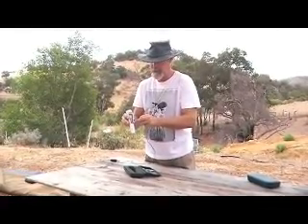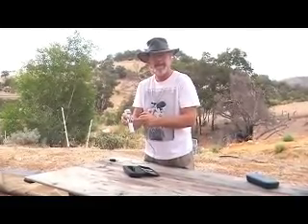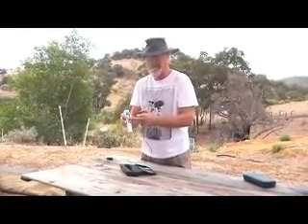And at the bottom you've got an on-off button, a hold button. So once it's in a solution, you can save the setting, so you can show other people or write it down. And there's a calibration button on there as well.